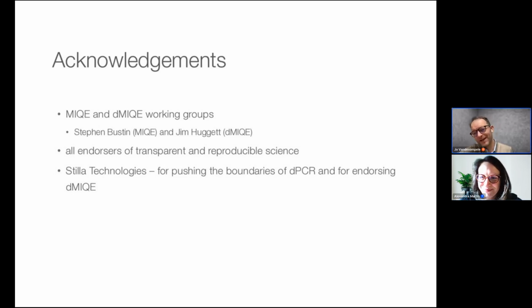It really depends. And I'm sorry, I cannot be more specific, but there is a concentration dependency on variance. We all know that if you have a high concentration, typically the reproducibility is better. This is true in any quantification method, including digital PCR. So there is no gold cutoff, but what is perhaps important, if this is really important to you, what has been agreed upon by many different organizations and bodies is actually the limit of quantification, which typically limits reproducibility at 35%.